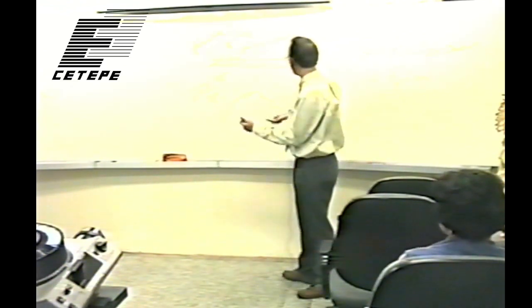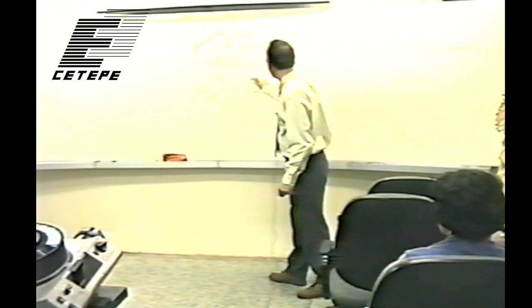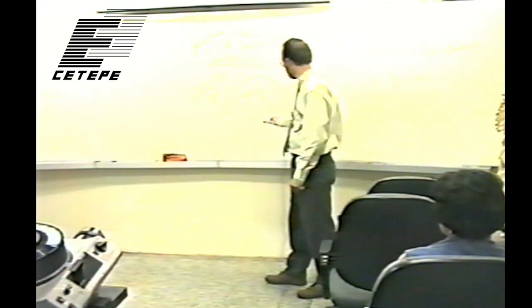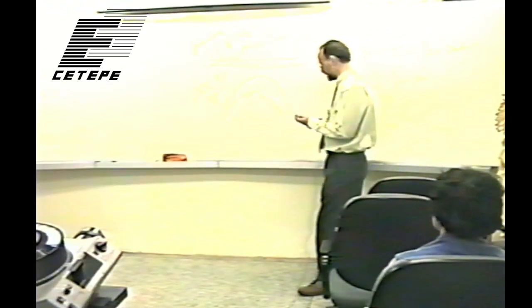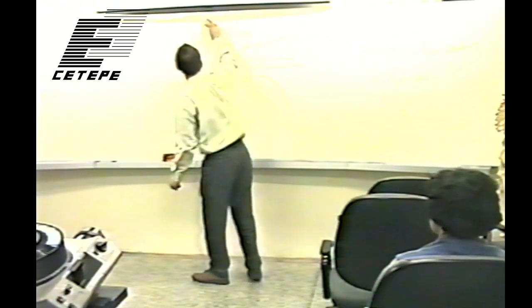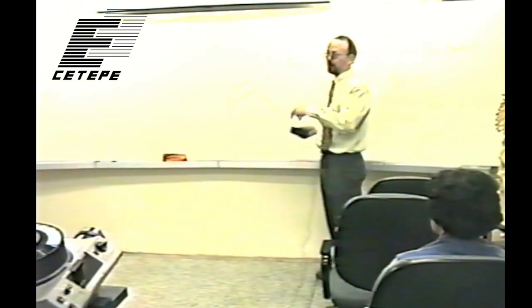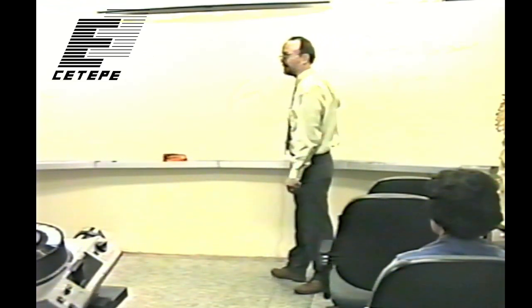And once you do that, it peaks out at over 80%, at red, like 600 nanometers. So they're much better. I wish I could afford one. You know, that number has come down. I think it would be well under $1 million now, but it would be significantly over 100,000, maybe 300,000.